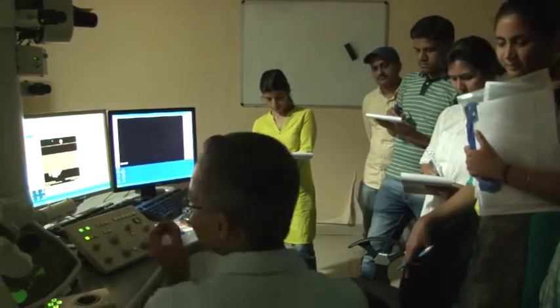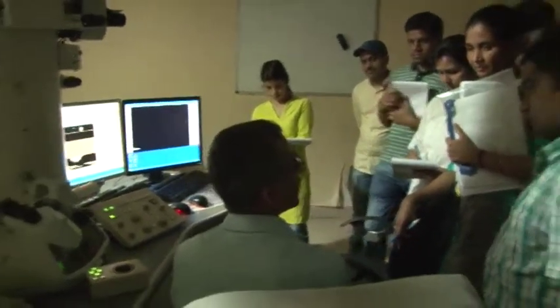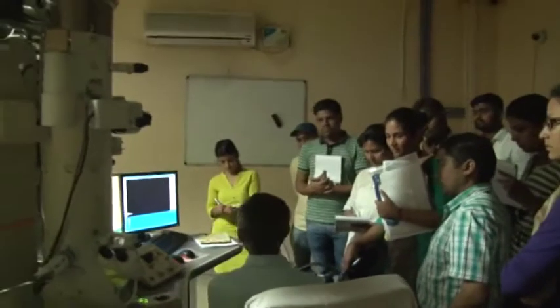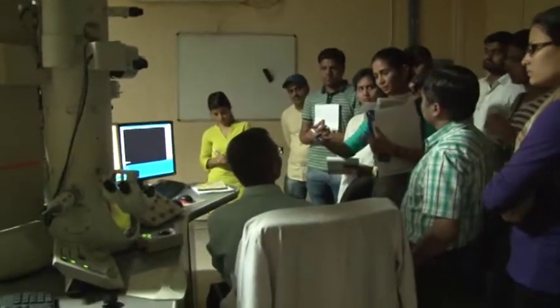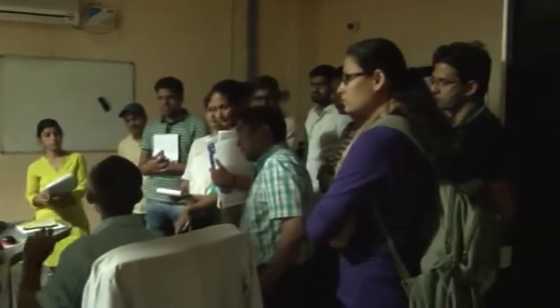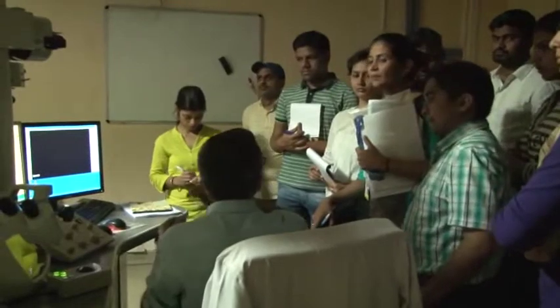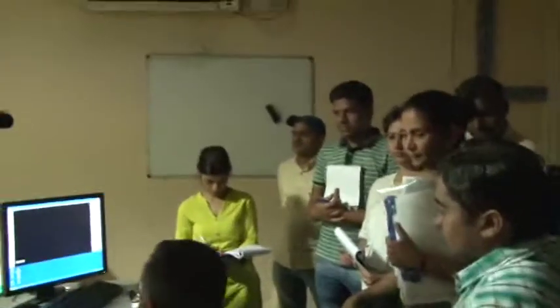So this is a dark field detector, and if you operate it at high angle, it can be called high angle annular dark field. Yeah, that's why I said depending on which mode you drive, it may have sectors and so on. I don't know the details.